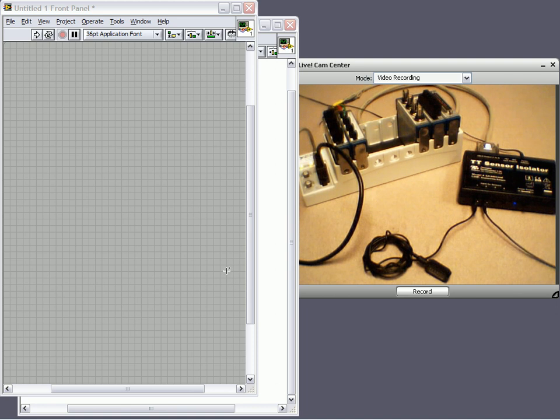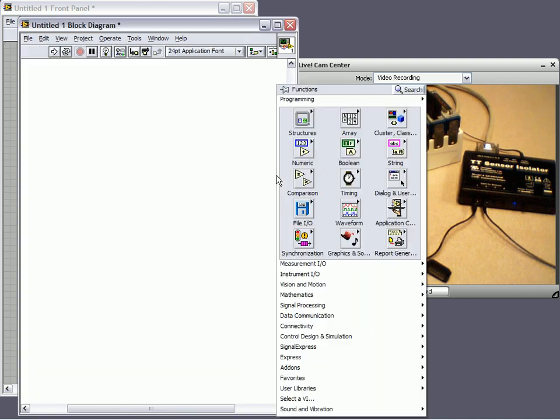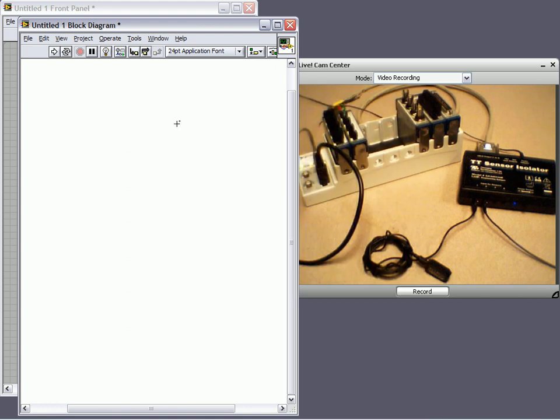This gray window is going to be the front panel, or the user interface, where we have controls and indicators. This white panel is going to be the block diagram, where the graphical source code of my program exists.